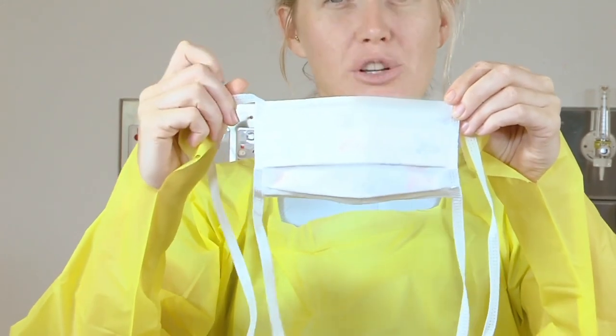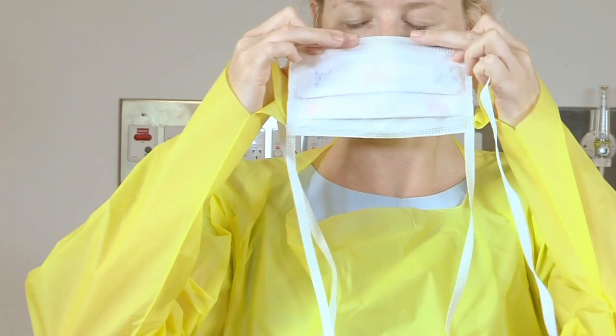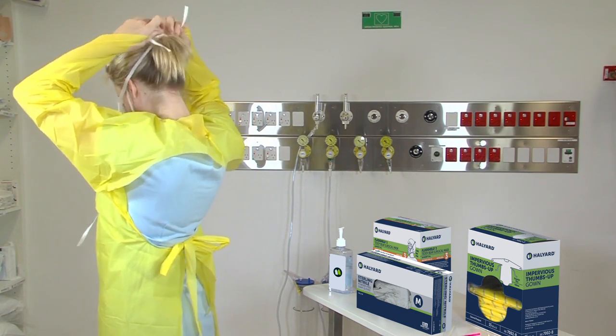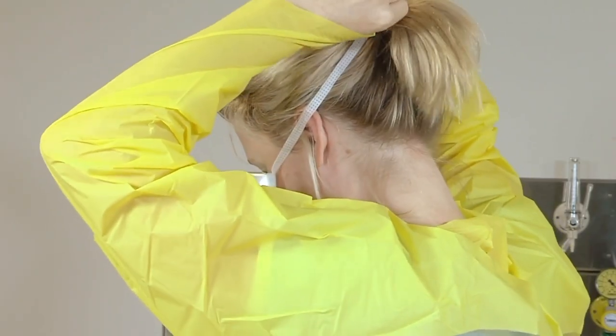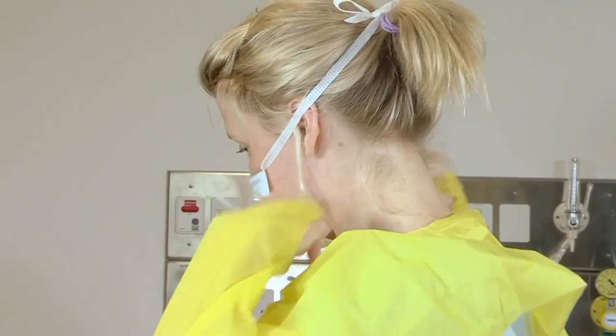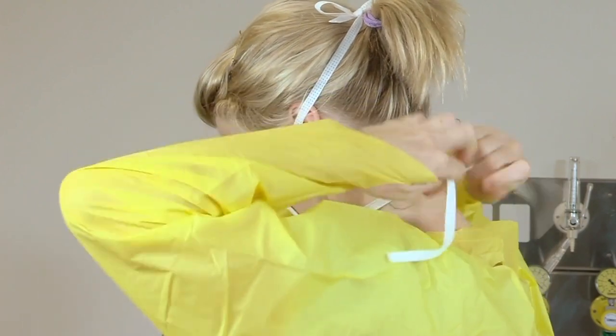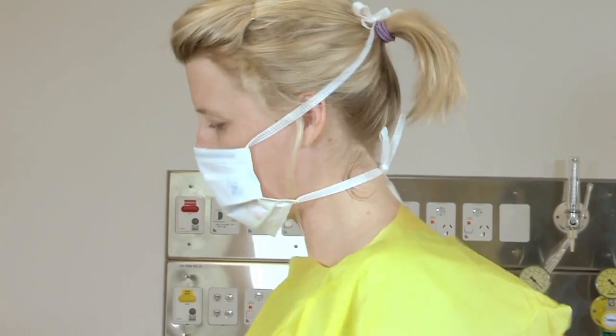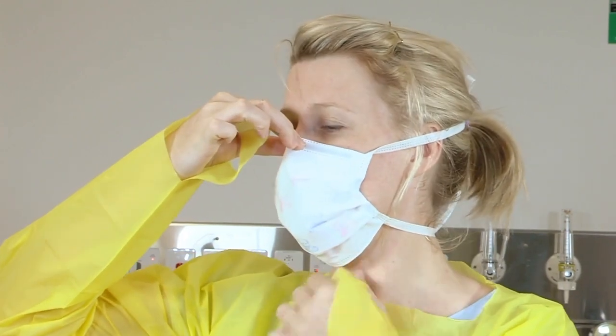Alternatively, place the ear loops over your ears. Once secure, smooth the flexible band across the bridge of the nose and the cheeks, and ensure that the mask is snugly fitted underneath the chin. Remember, if you are donning an N95 mask, you need to at this stage perform an appropriate fit check.